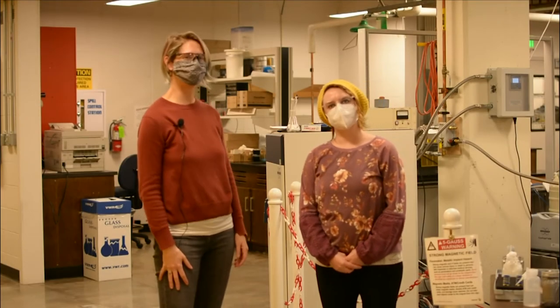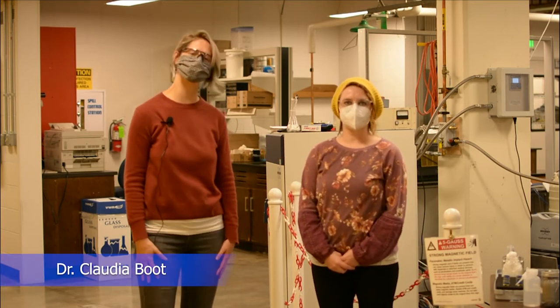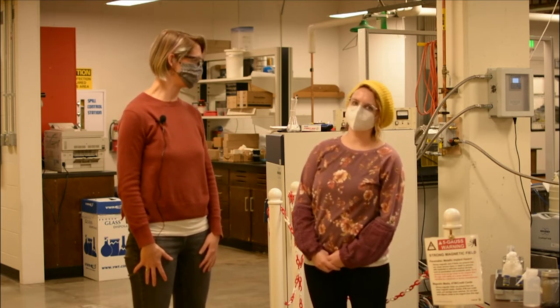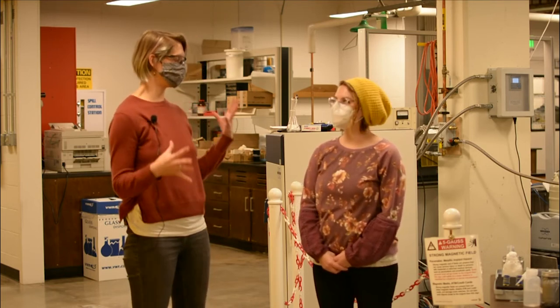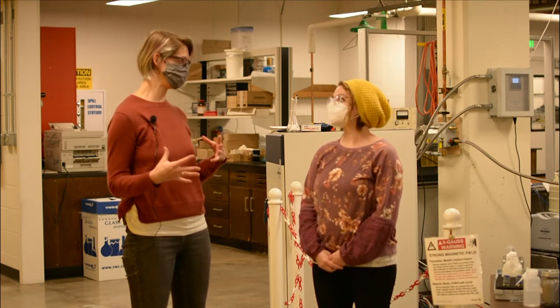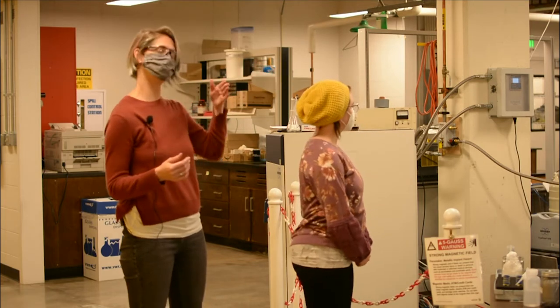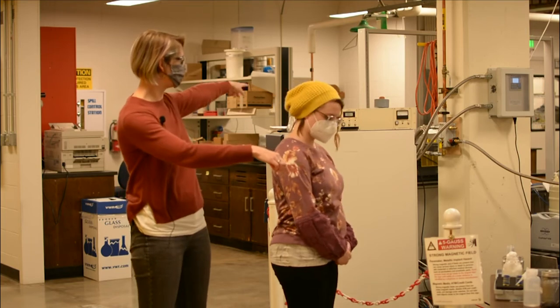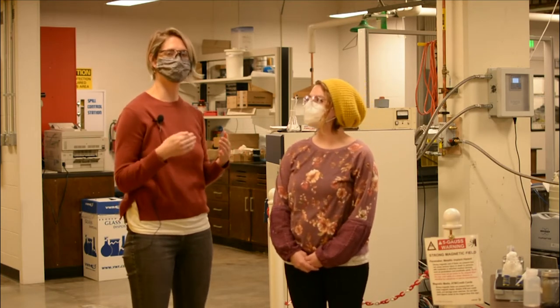Thank you for joining us today in the Analytical Resources Core Materials and Molecular Analysis Center magnet safety training. I'm going to be teaching Alyssa about magnet safety today. The first thing to be aware of is that NMRs have strong magnetic fields surrounding them. Magnets can be unshielded, meaning the magnetic field extends beyond the door — you can see the five gauss line that goes around the instrument. To enter and approach the magnet, you need to have magnet safety training.